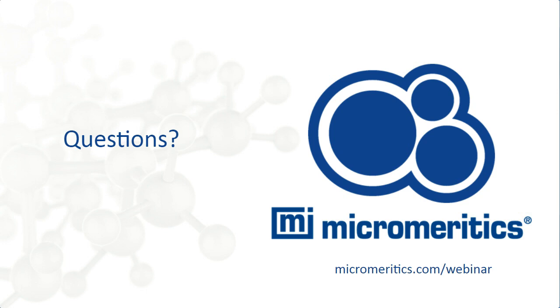Okay, thanks. And again, on a similar vein in terms of the practical setup of the tests, could you just clarify? In the final case study, when you were talking about the crusting investigations, are the samples stored and humidified within the vessel in which they're going to be tested, so that the crust is preserved? Yes, that's right. It's exactly that.